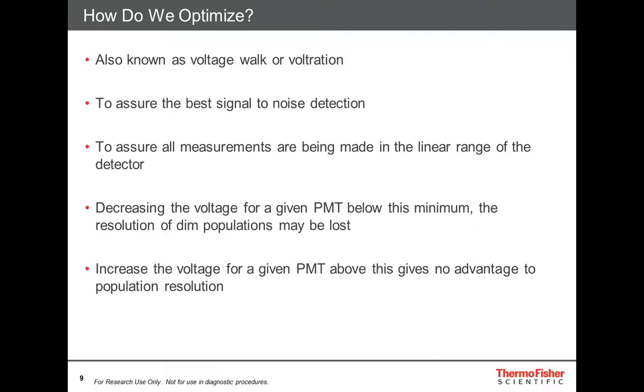So when we started in flow cytometry, we used analog instruments. We didn't know a lot about PMTs, or at least I didn't, and we had a 4-decade scale to graph our data. So we could walk up to an instrument, take an unstained sample, and put it in that magic place that we know is no longer magic, that first log decade on our scale.